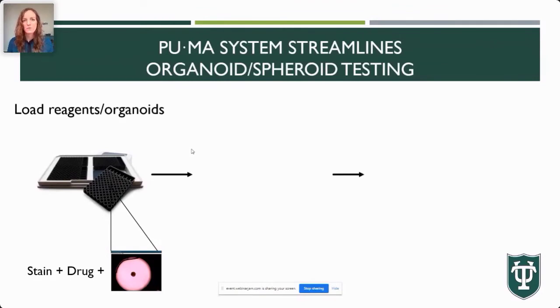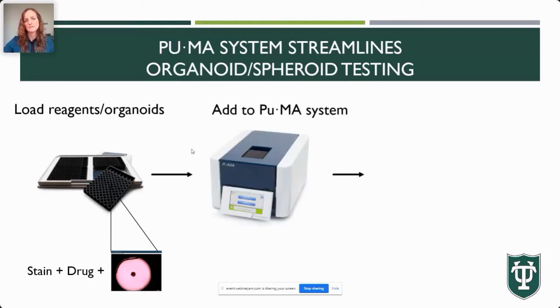You can have multiple organoids in a well if you were interested in not having biologic triplicates, but we could have up to 3 organoids comfortably in this well. We would transfer the intact organoid. These are not generated from single cells plated in the PUMA system.